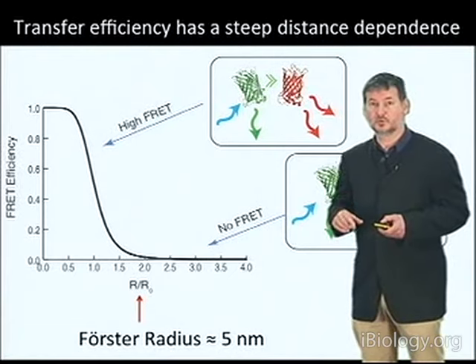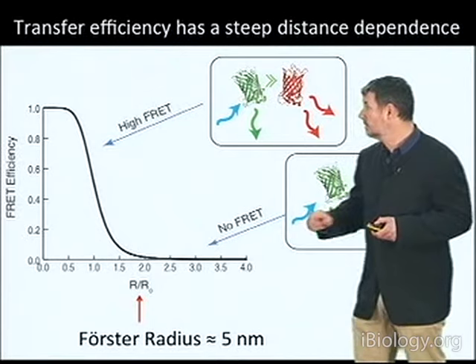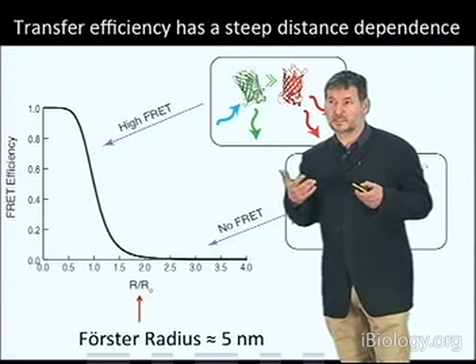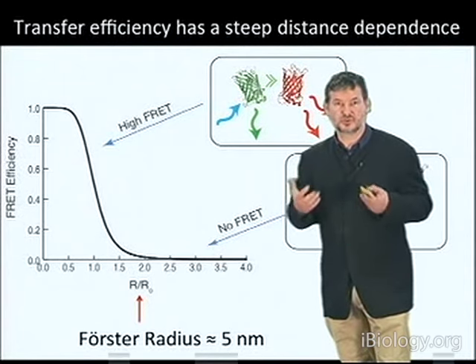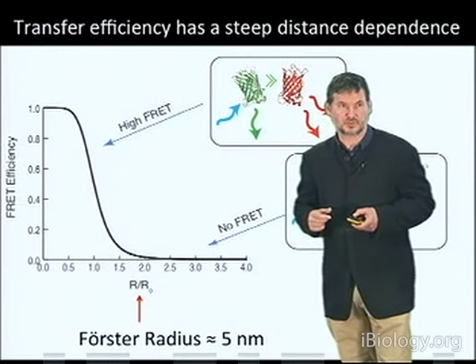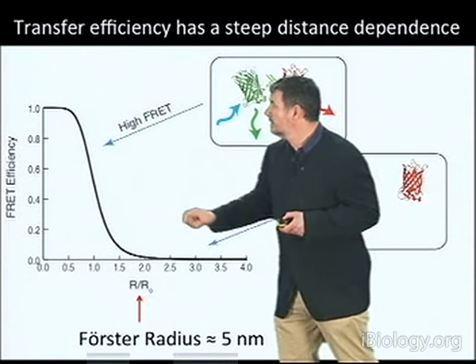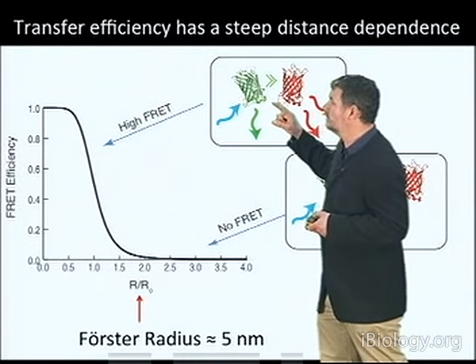However, if you go to a concentration of 1 millimolar, the average distance becomes already something like 10 nanometers, and we're getting close to this point over here. However, when we express proteins in cells, we are typically on the order of 1 to 10 micromolar concentration. And so in solution, that should not be a problem. So we're way off here. So we don't get this trivial FRET process, which is due to the concentration and average distance between molecules. Because of the steep distance dependence, we basically have a situation where non-interacting molecules don't give you FRET, and interacting molecules give you FRET.